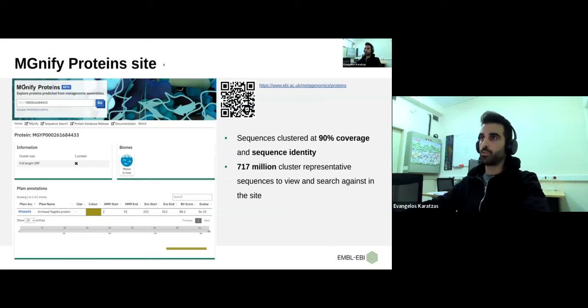So starting with the MGnify Proteins site, this was released recently, if I'm not mistaken, 2 months ago for the general public.